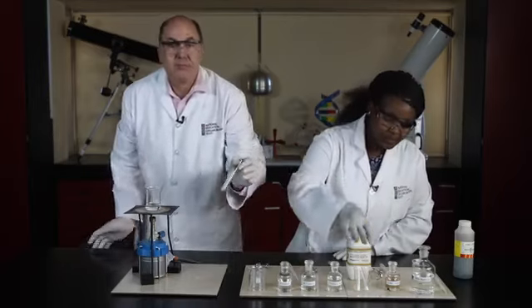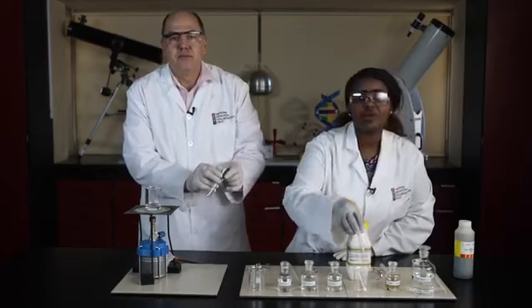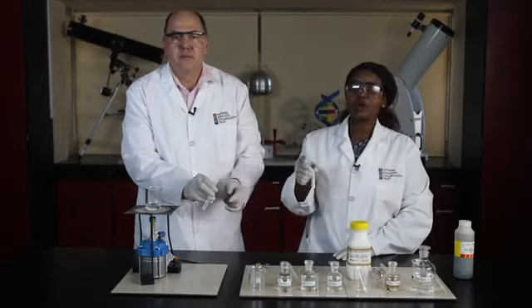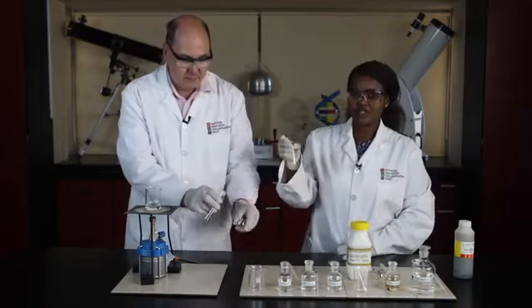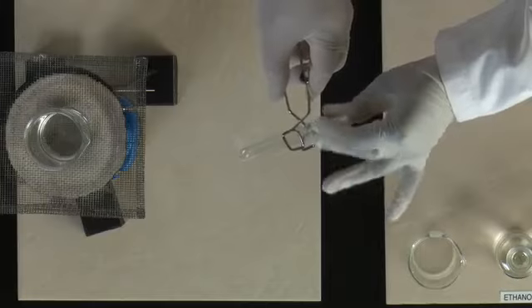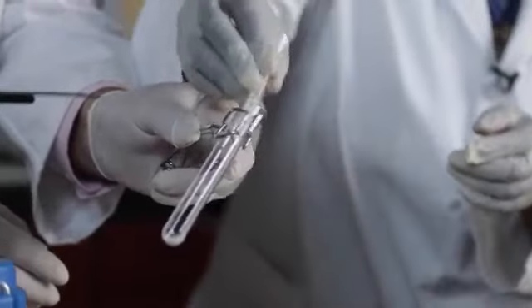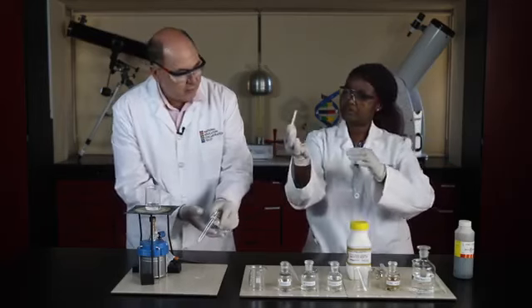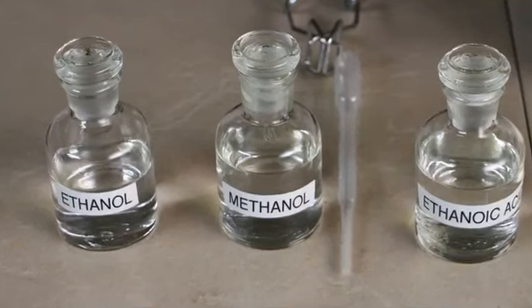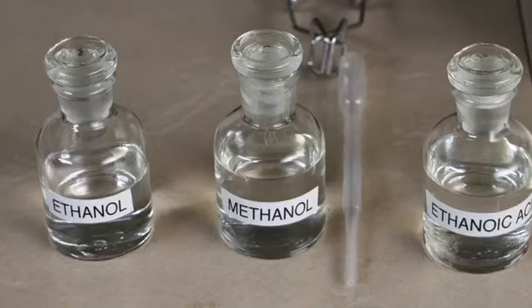Here it is. We have measured 0.5 grams of salicylic acid to use in this reaction. So we'll add the salicylic acid to the test tube. Let's take some of the methanol and rinse out the rest of the acid there.